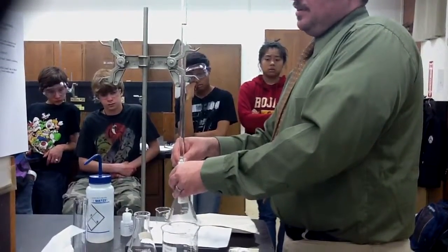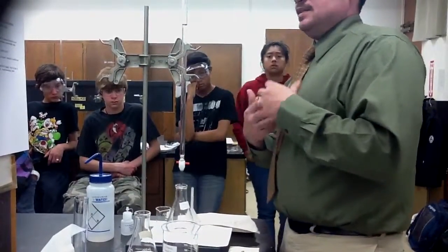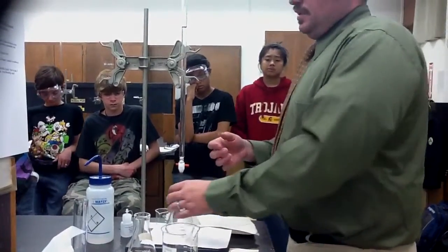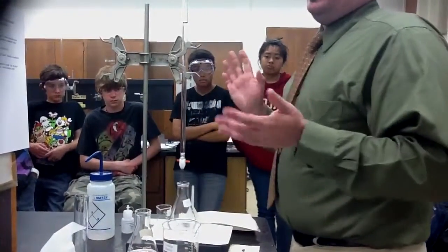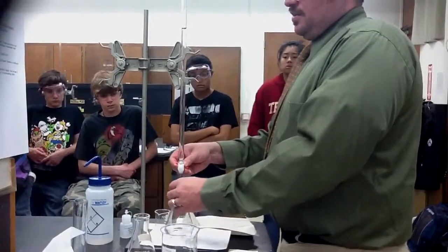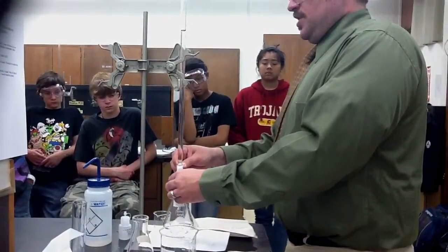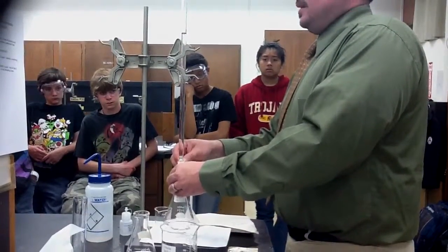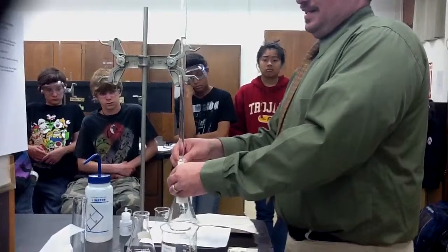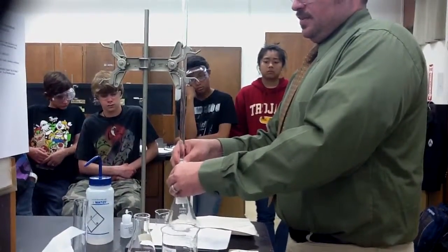The reason I stir it is to see whether I have any excess or still remaining acid left over, because as soon as you stir it up, as soon as you shake it, the color goes away. This technique also requires some patience. You don't want to rush this. Don't be discouraged if you're almost there, you do one little shake, and boom, it's gone. Don't worry about it. That means you're almost at the end point. So keep shaking it.